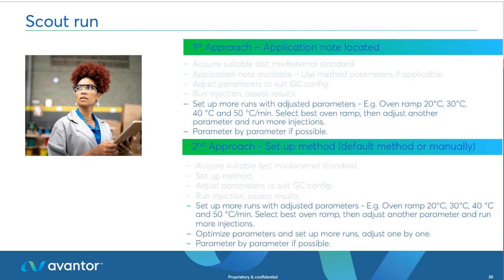Run an injection, and then you can set up more runs with changing it parameter by parameter and then selecting the best out of that run set, and then optimize and set up more runs parameter by parameter.